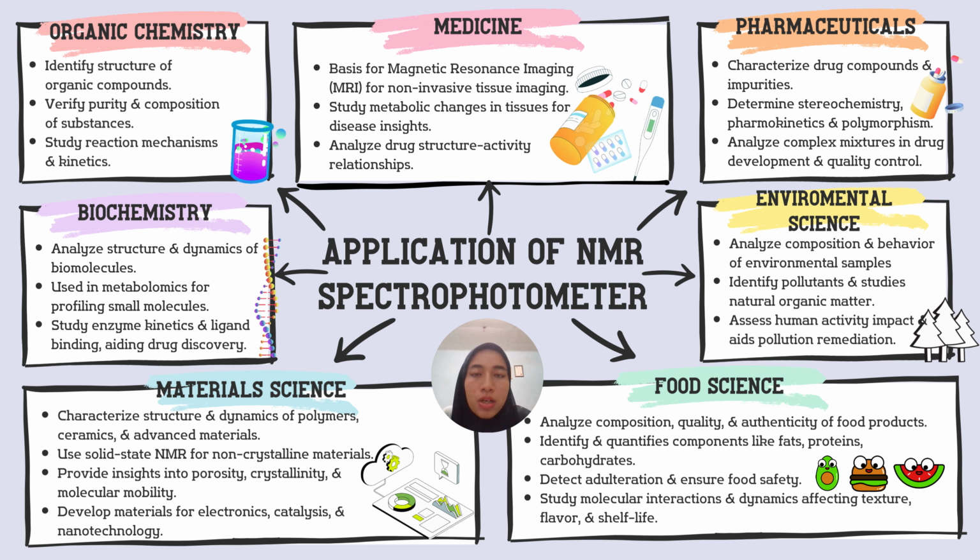Secondly, in biochemistry, NMR is vital for studying the structure and dynamics of biomolecules like proteins, nucleic acids, and lipids. It determines their three-dimensional structures in solution, aiding in understanding their function and interactions. NMR profiles metabolites and studies enzyme kinetics and ligand binding, crucial for drug discovery and development.